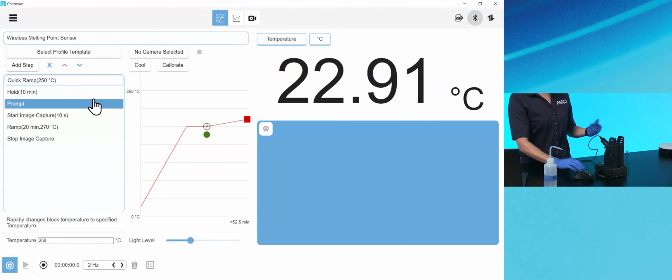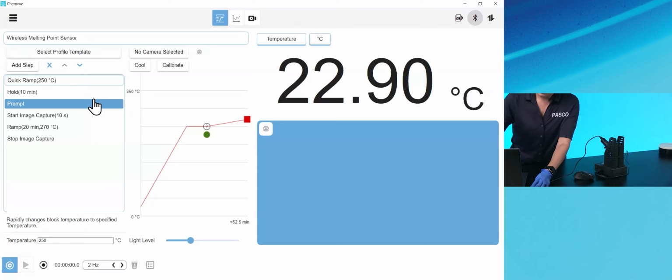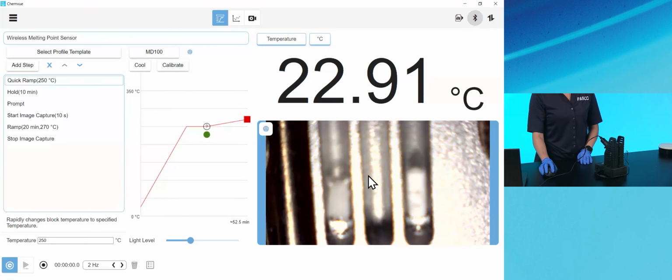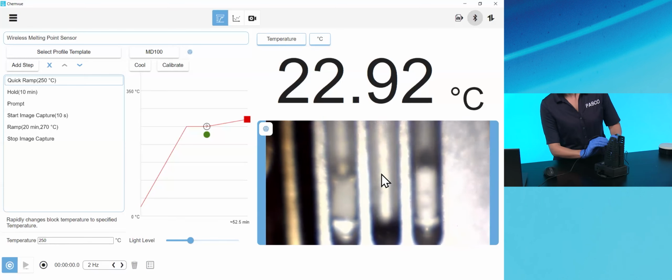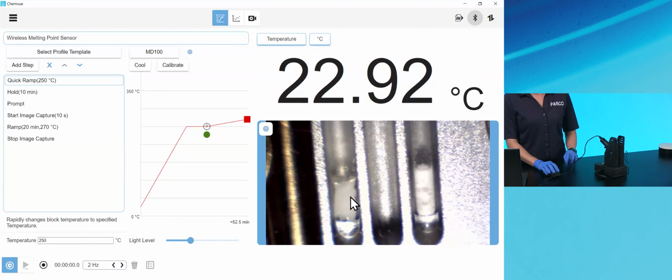This looks different, right? I have a camera that I purchased, with my accessory here. So I'm going to plug that in. It's a USB connection. And when I plug in that camera, there it is. It looks a little blurry, so I can adjust the focus by moving the camera manually, focusing it. That's pretty good. What I've got here on my preview on the left is a sample that I ran yesterday. I melted it. I already did the analysis on it, so it's already melted. On the right, I have an unmelted sample, so you can see the difference in what they look like.